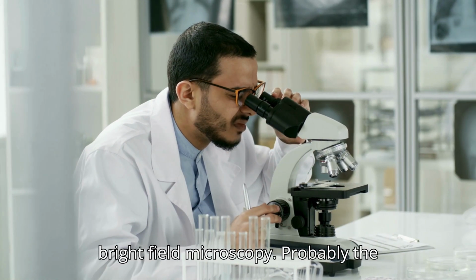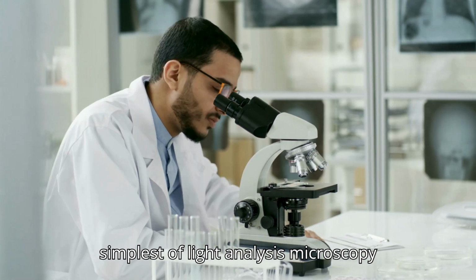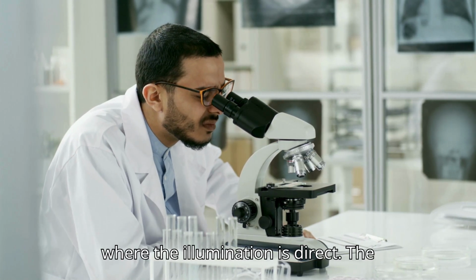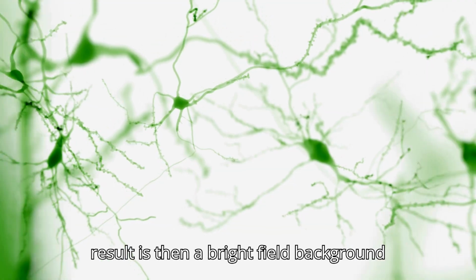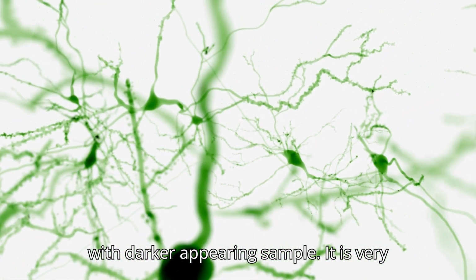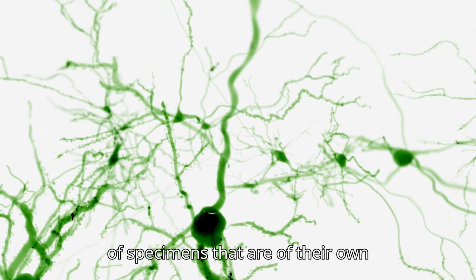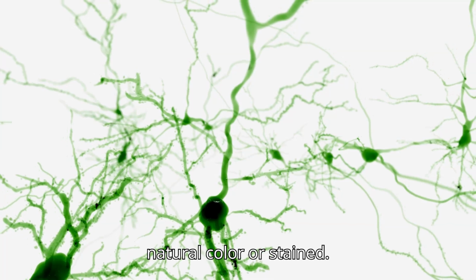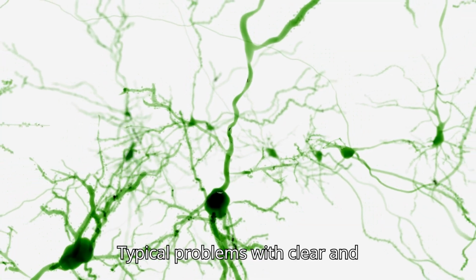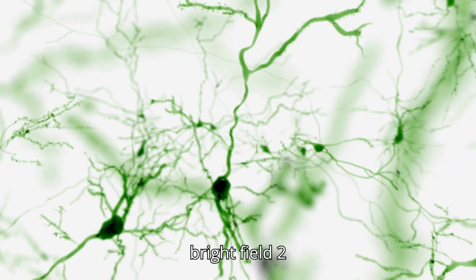1. Bright field microscopy. Probably the simplest of light microscopy, where the illumination is direct. The result is a bright field background with a darker appearing sample. It is very useful for observation and preparation of specimens that are of their own natural color or stained. Typical problems with clear and translucent cells and tissues occur with bright field.